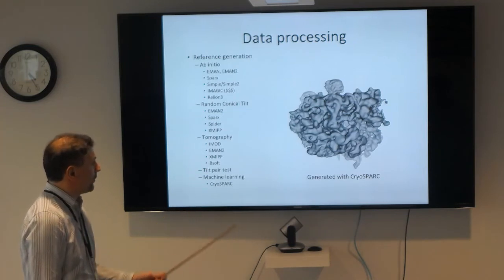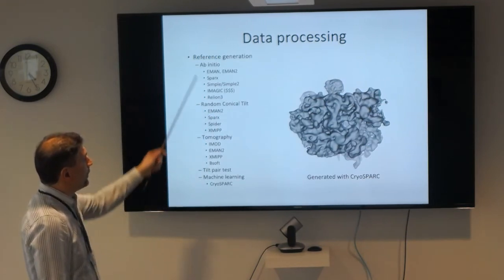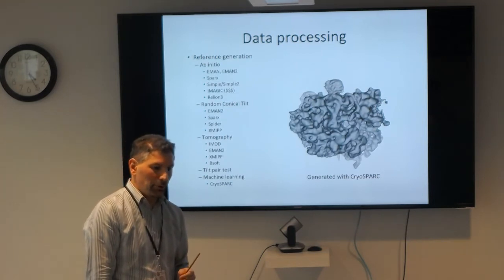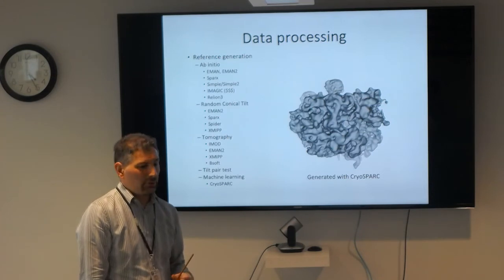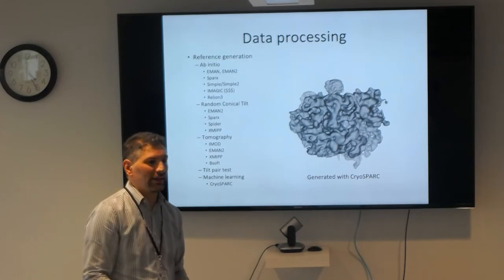Obviously, you have tomography with subtomogram averaging. This is a lot more involved than these two additional techniques, and you really need the expertise for tomography. And in my opinion, the tomography programs haven't reached the same point as single particle analysis has. With single particle analysis, you don't necessarily need to know what you're doing. If your data set is good enough, you can just push buttons and get a reconstruction out.